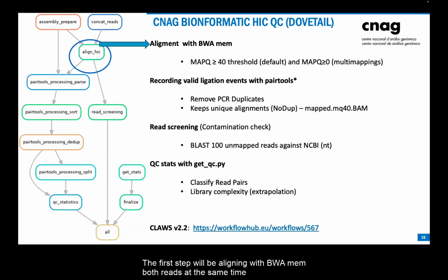The first step will be aligning with BWA-MEM both reads at the same time using a certain mapping threshold. Normally you use 40, that is the default recommended. That means it's kind of the threshold for uniqueness of your alignments.